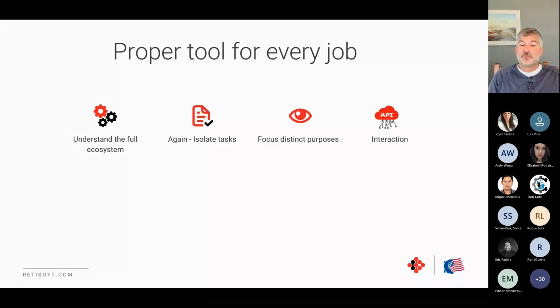That's where we move to interaction. Since we're looking at a lot more tools than just the one LIMS system, it becomes increasingly important to select tools that are designed to live in a shared ecosystem with other products. Gone are the days of one tool to do everything. If a tool isn't designed with clear APIs and the ability to trigger to or from other systems, it's likely not long for this world anymore, because that is the need when you are dealing with multiple tools. They have to be able to talk with each other.